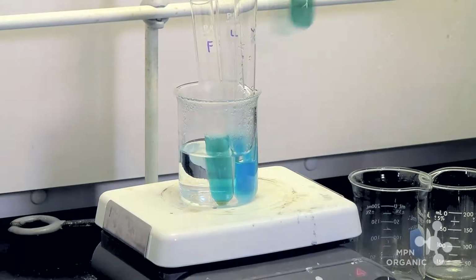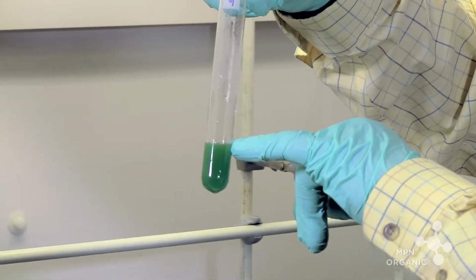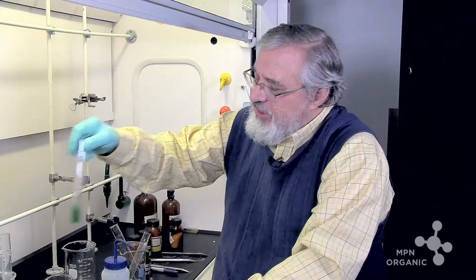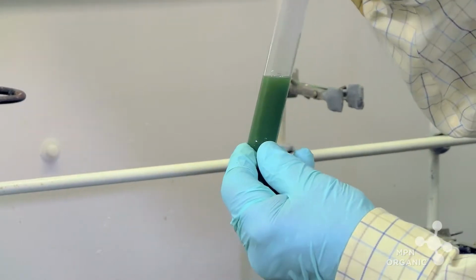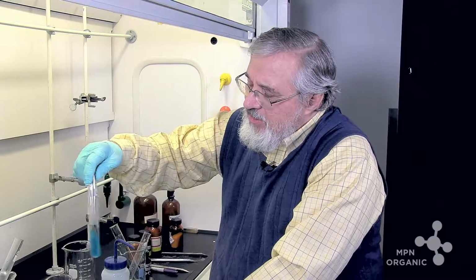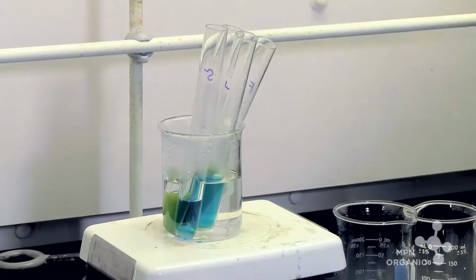reactions will indicate. Now you can see that glucose is starting even now to show an orangey precipitate, which is characteristic of a copper 1 oxidation state. In fact, fructose is the champion of these. It goes very, very fast, and it's starting to turn this color. Let's see, where's lactose? Lactose is slow. Sucrose, nothing seems to be happening. Let's just let them go for a minute.